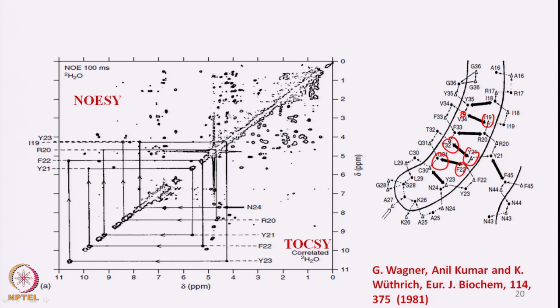Okay, and that essentially can be identified using TOCSY and NOESY, and this was a very established technique almost 30 years ago. Professor Anil Kumar is a pioneer who developed these NOESY techniques, which are now a core of structural biology. He showed for the first time how you can use NOESY for doing the structure calculation for a polypeptide chain. So, this model building helps us in identifying and fixing up the assignments.